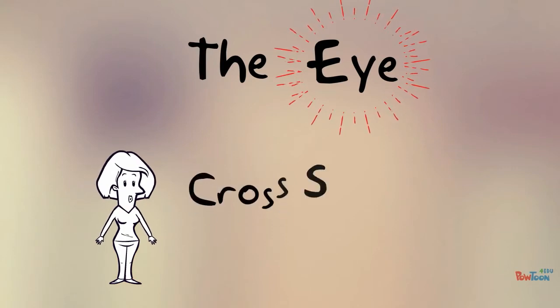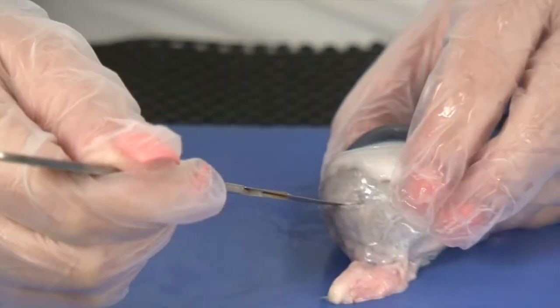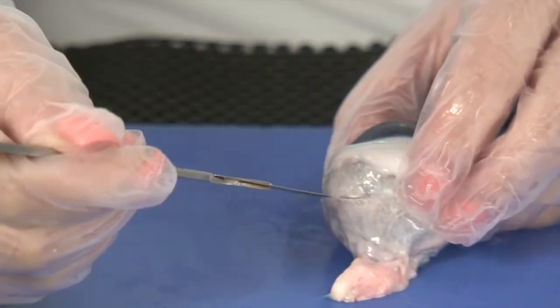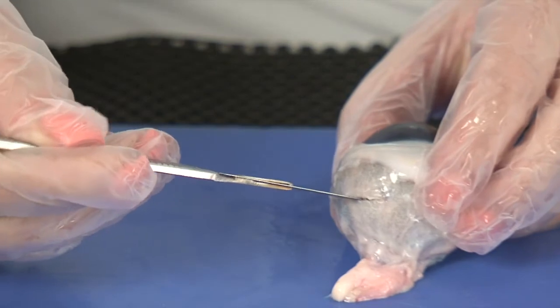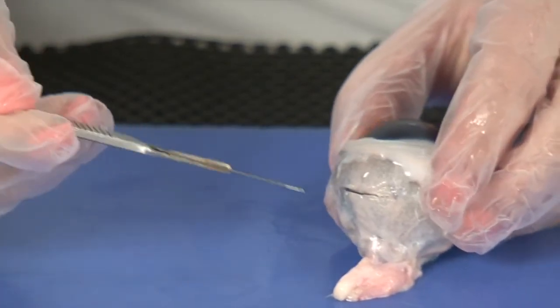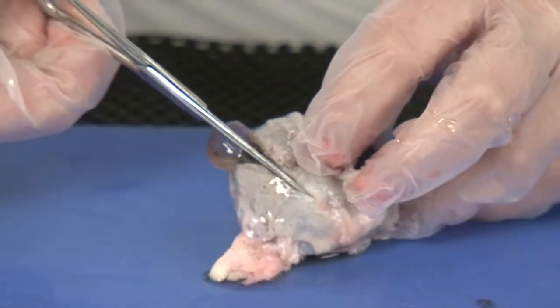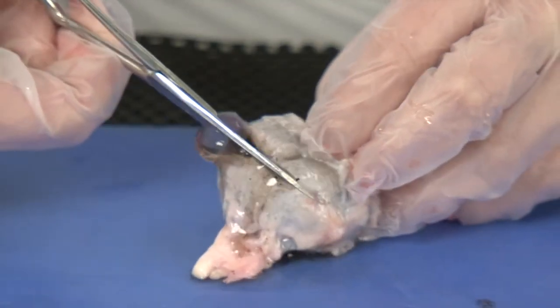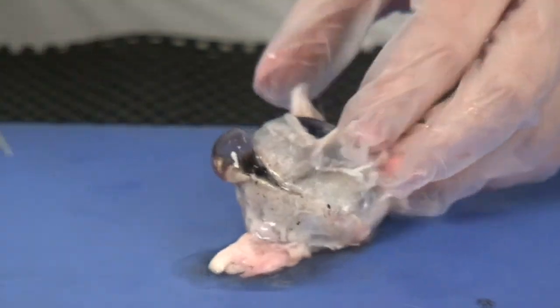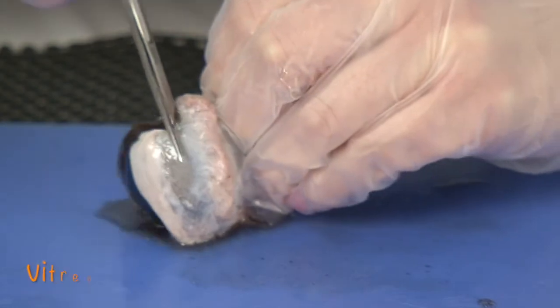The eye, cross-section. Apply light slicing cuts as you cut the eyeball in half. The cut should be about halfway between the cornea and the optic nerve. See the diagram in your handout. Identify the vitreous humor.